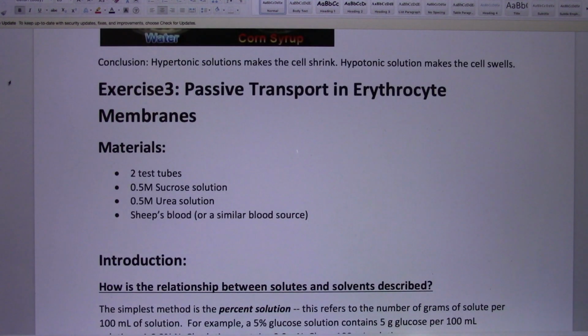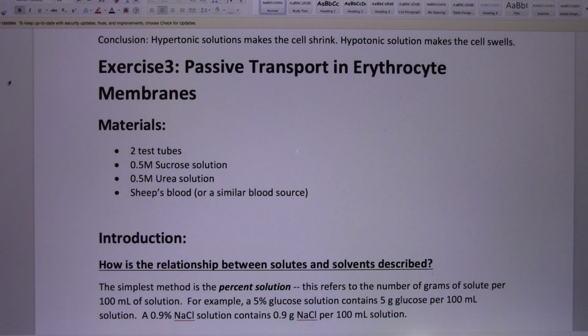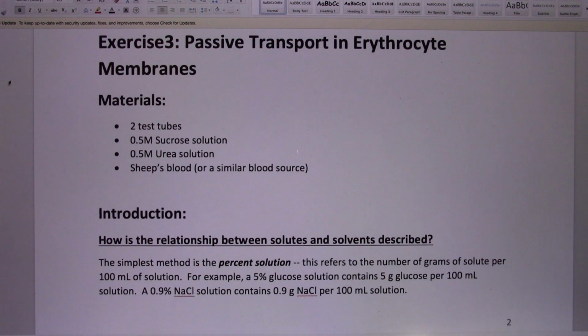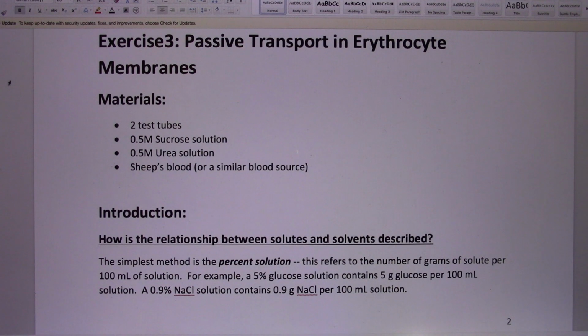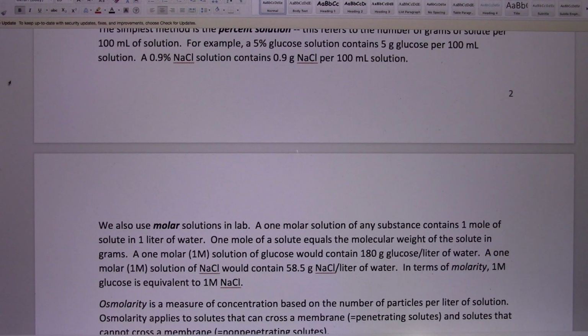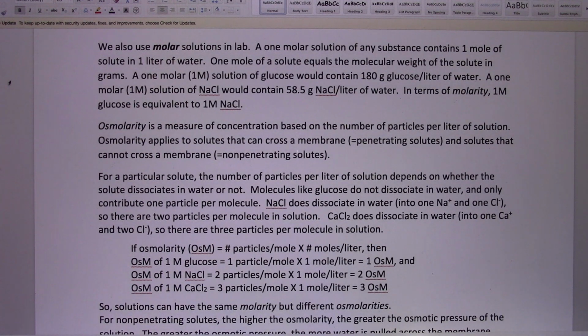And experiment 3, we use the artificial blood. We won't do the experiment at home, but I can explain the experiment to you. So it's pretty straightforward. We prepare 2 artificial blood solutions. So these are the process.